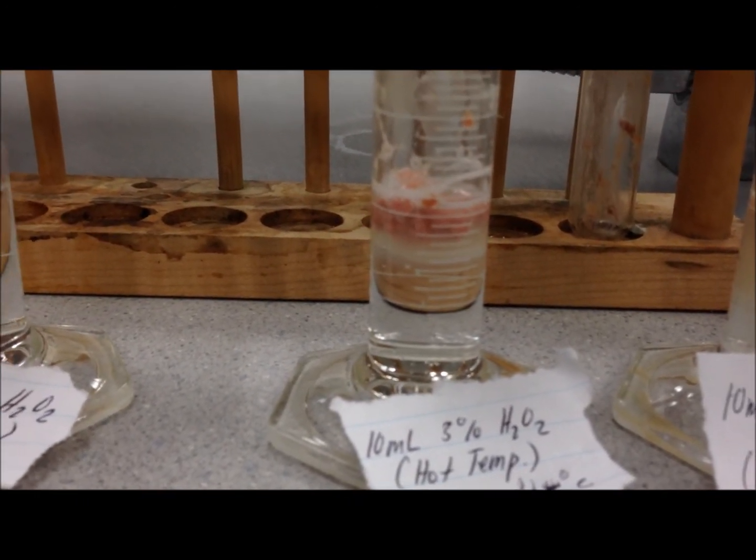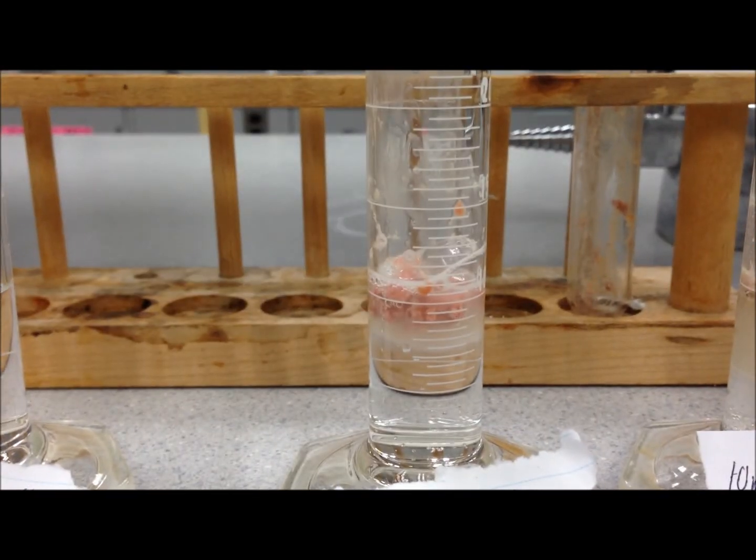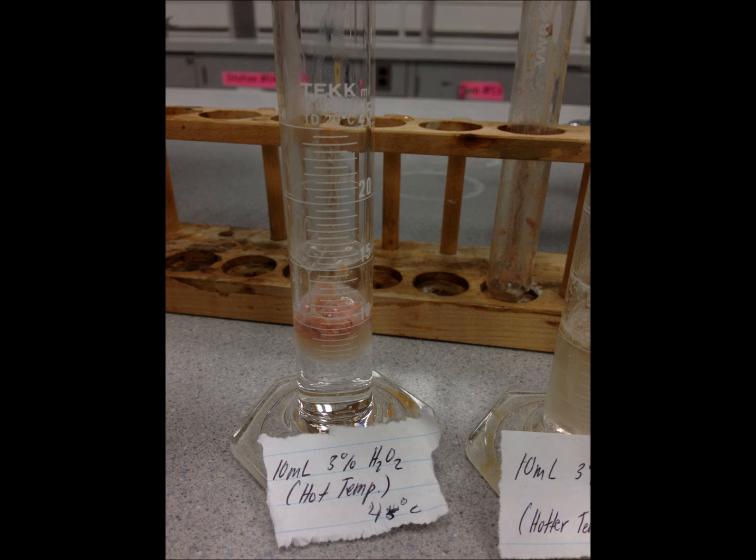Then we observed what changes were happening and how much the oxygen bubbles were produced in each cylinder, and we recorded the data and observations into our notebook.